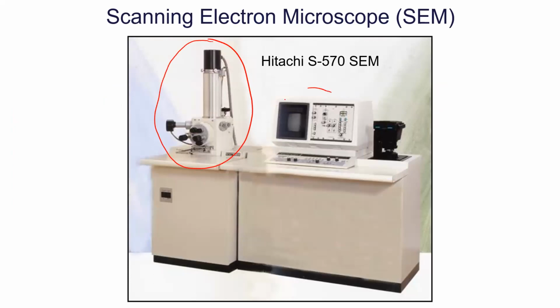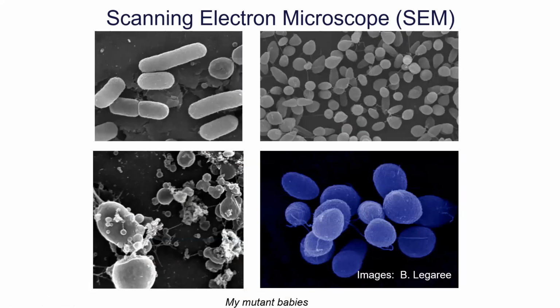The control panels are right here, over here on the right-hand side, it's basically being run off a typical desktop computer. But at the time, I think it was $100,000 in the 1980s, and it's working just fine. So why upgrade it? Nowadays you're looking at double or triple that price for something equivalent. So if it's working, there's nothing wrong with that.